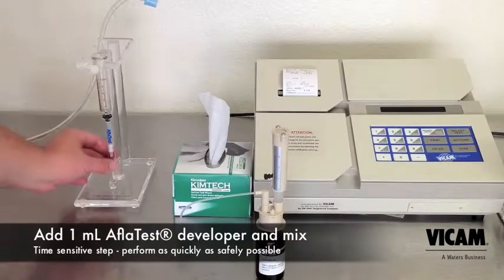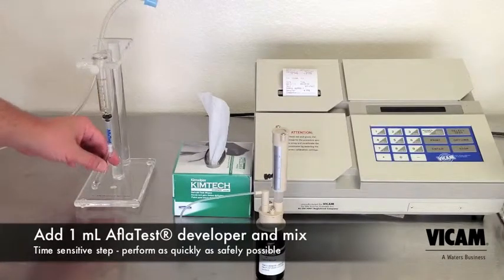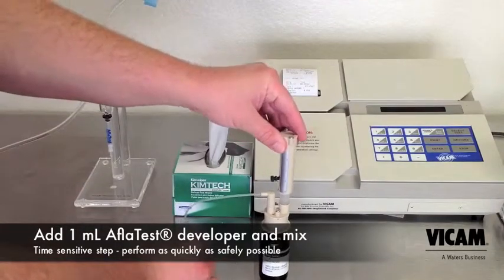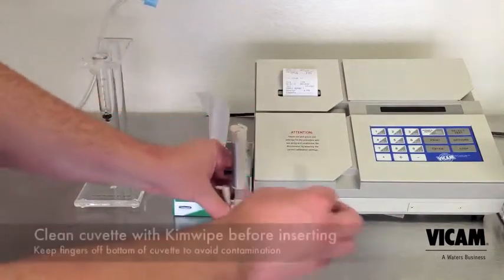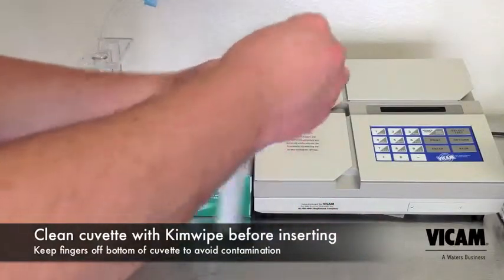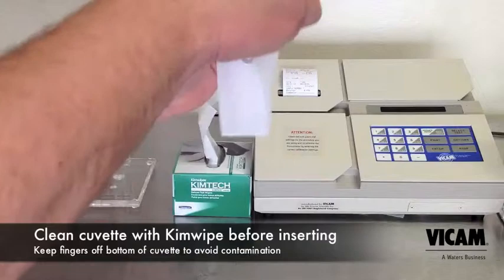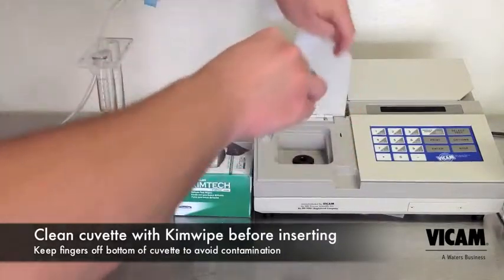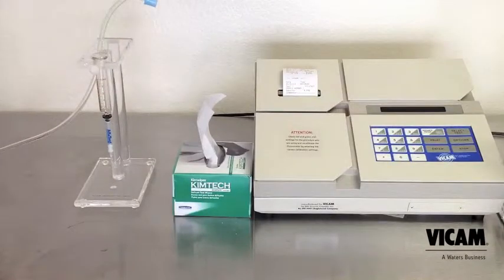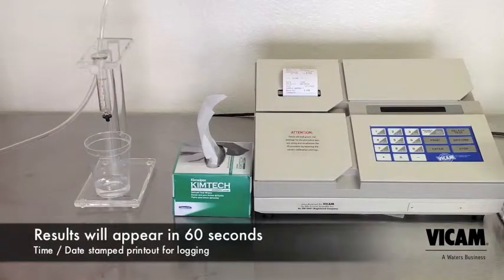Remove the cuvette. Add 1 milliliter of fresh AflaTest developer solution. Mix. Clean the cuvette with a fresh kim wipe before inserting into the fluorometer. Because you checked your calibration settings with the yellow standard, the fluorometer was set up to test for aflatoxin and was waiting for your sample. After 60 seconds, your results will print and appear on the screen. Remove the sample and you're ready for the next test.